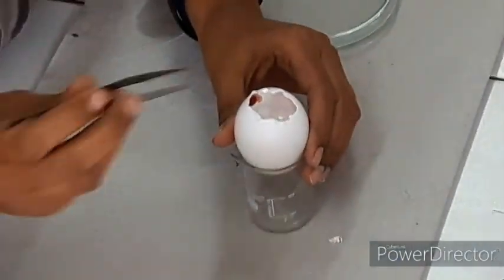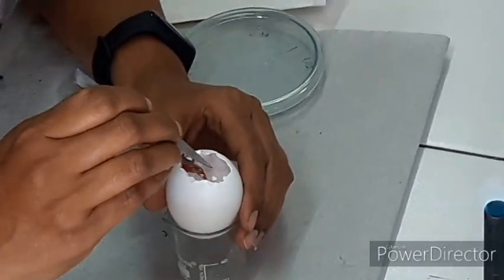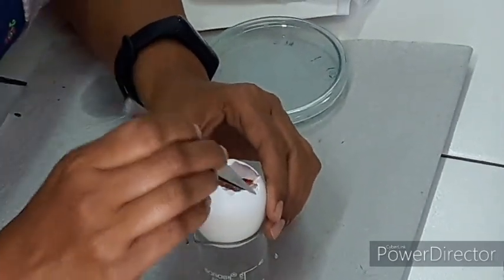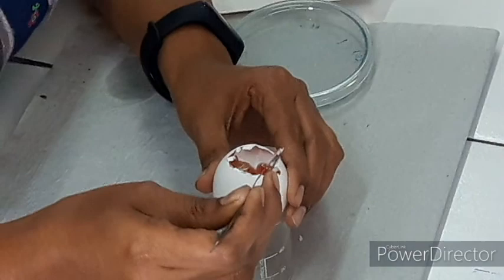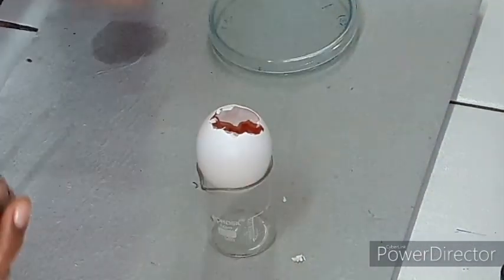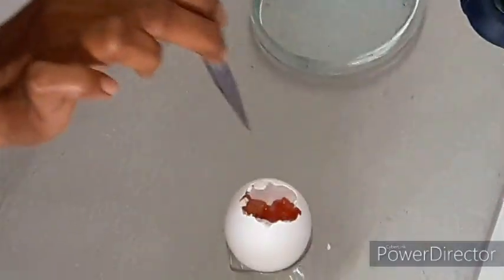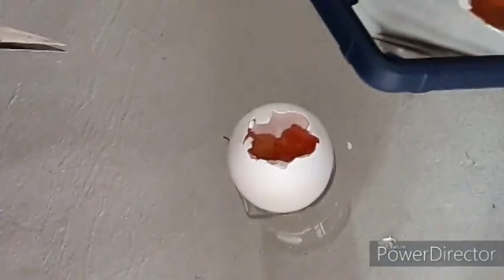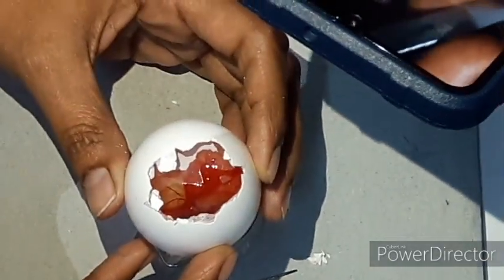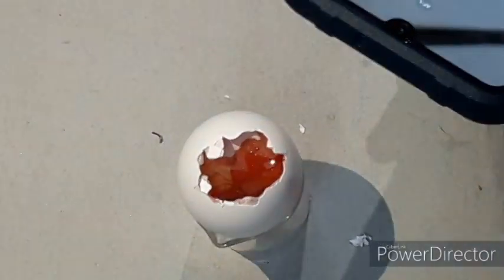As we see in the video, with the sterile forcep the shell membrane is removed. After removing the shell membrane carefully, what we observe is the chorioallantoic membrane of the egg. The chorioallantoic membrane as well as the vasculature of the egg is revealed. If we observe very carefully in the video, we see movements of the embryo.